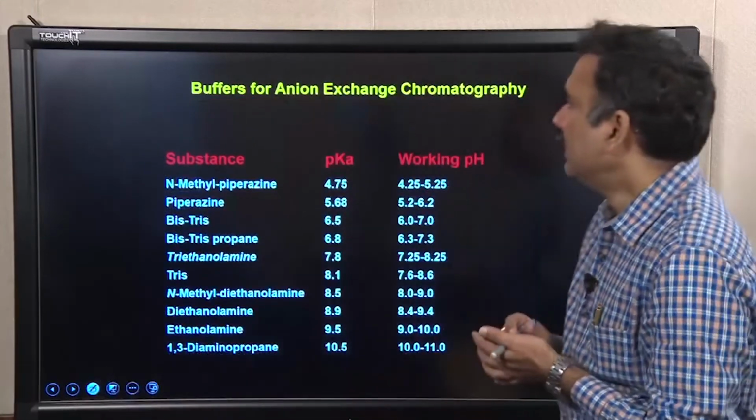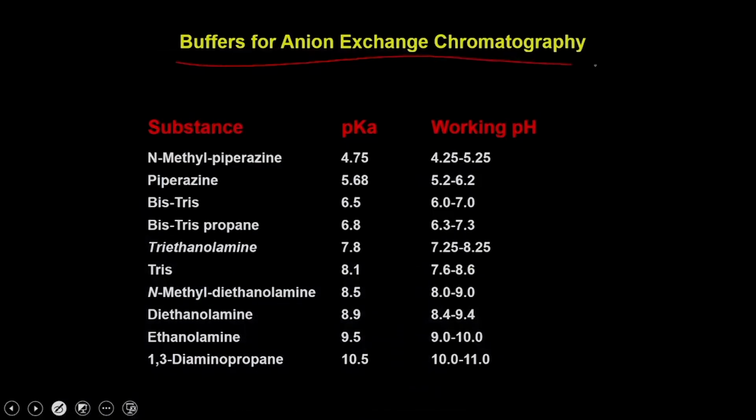Similarly, you have different types of buffers for anion exchange chromatography. The only thing you have to consider is the pH range in which you are interested to work.